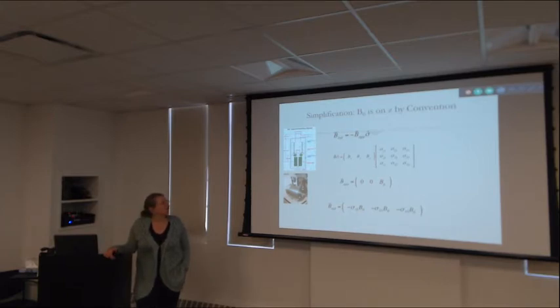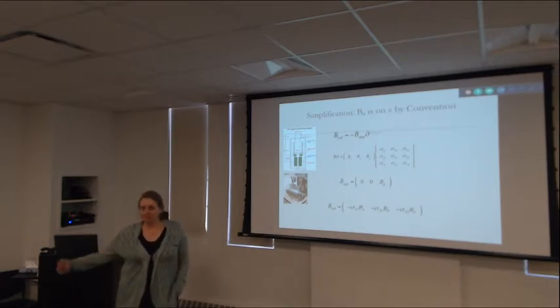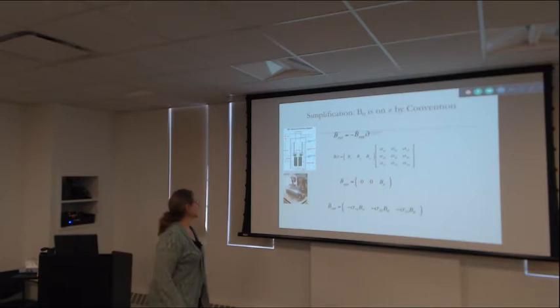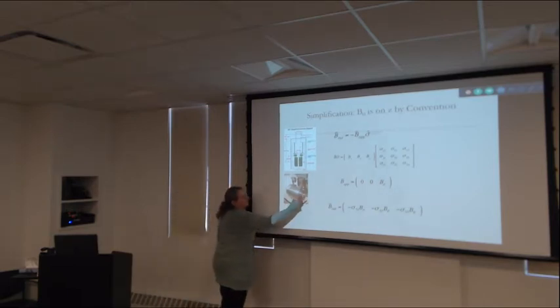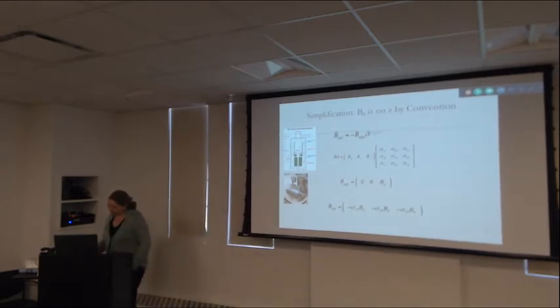And then I put these 2 cartoons to show you that whenever I say this, I always start pointing to the ceiling and the floor, but we know that we're starting to have a few magnets around this place that actually run this way too, right? Not our measuring magnets, but some other magnets. You can make the magnet go any way you want, but whichever way it goes, Z is along the magnetic field, right? So long as Z.